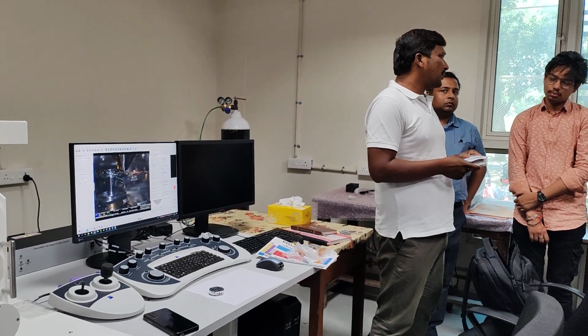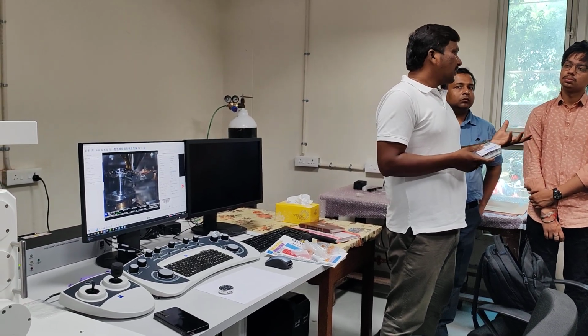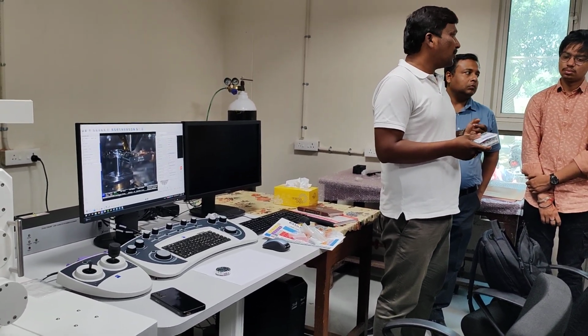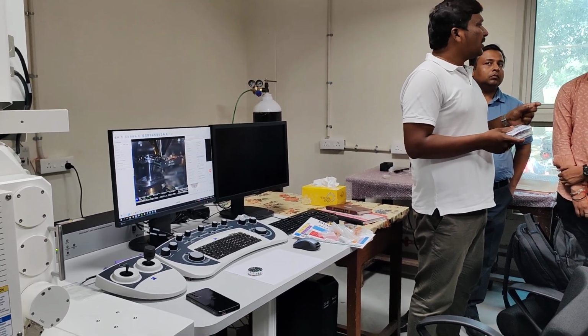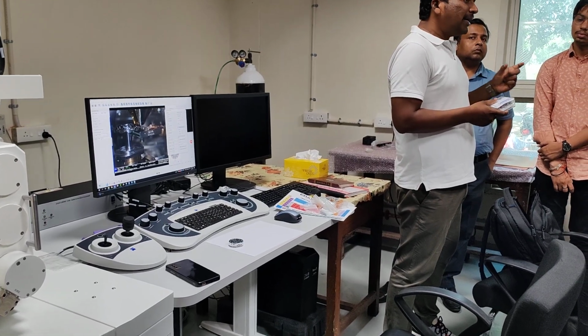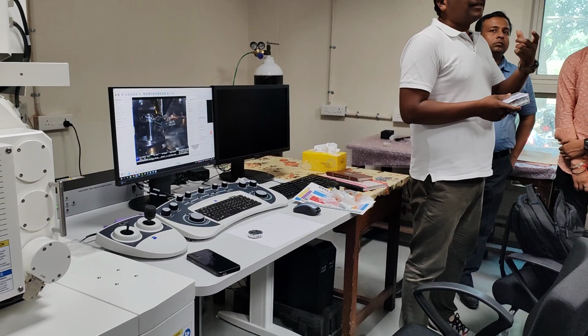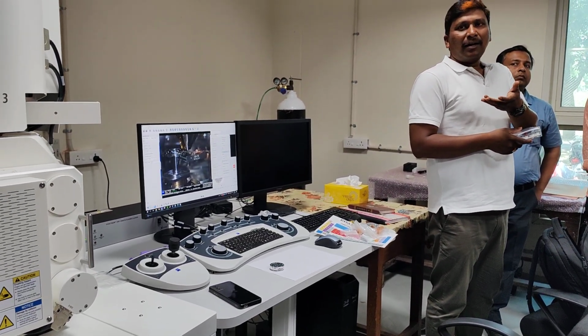You can submit the sample, but the only thing is, don't submit the sample without giving the information. If you submit the sample blindly, we cannot understand what parameters are suitable. By that time the electron beam induced effects may destroy the features, right? So give complete details and what exactly you are looking for. Then he can choose the detector, because each detector has its own advantages.